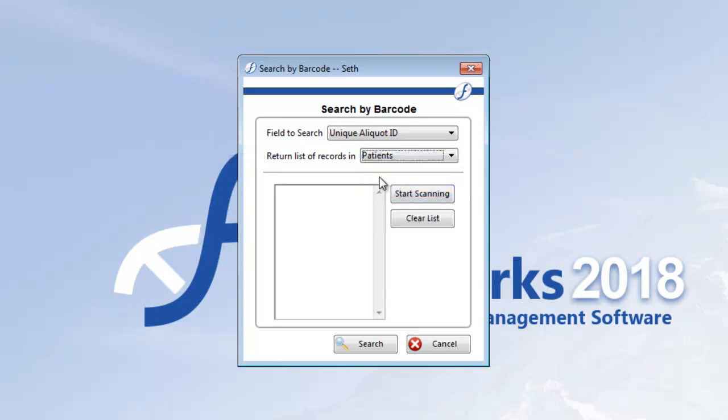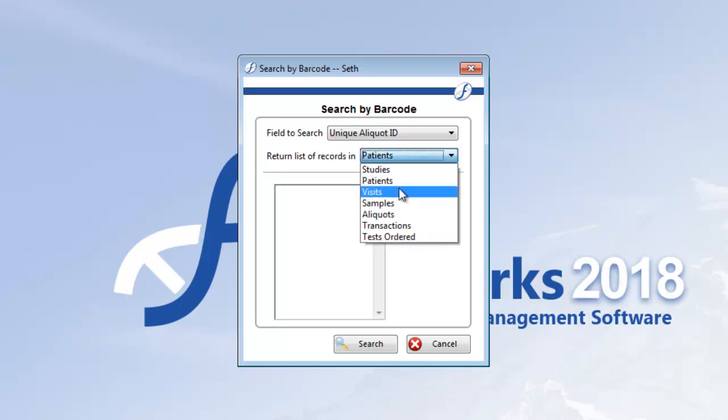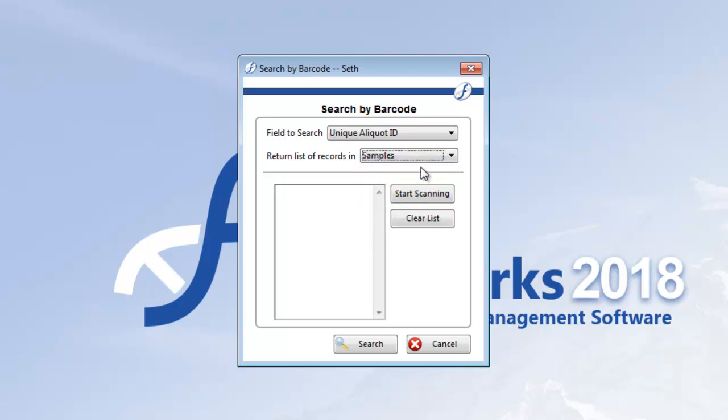And if instead I wanted to see the samples that these aliquots belong to, I'd select samples. It's up to you. And remember that you can always see inventory relationships later on the list view. You'll see that in just a second.